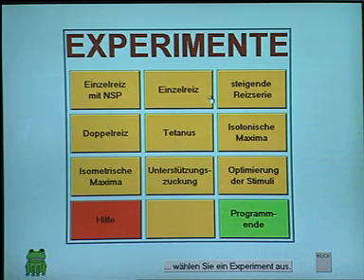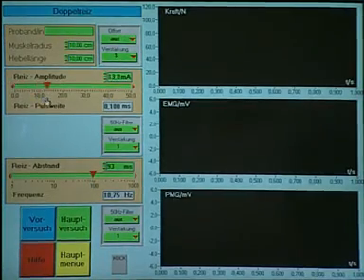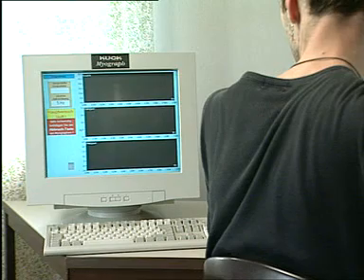On the computer, the menu offers eight experiments. Once you have chosen your experiment, you can optimize all parameters for a very good experiment in the next step. This experiment works automatically.